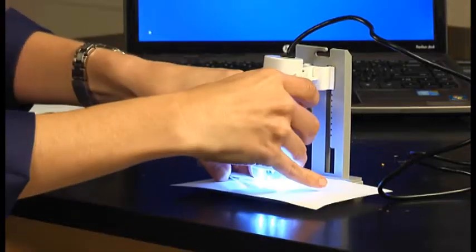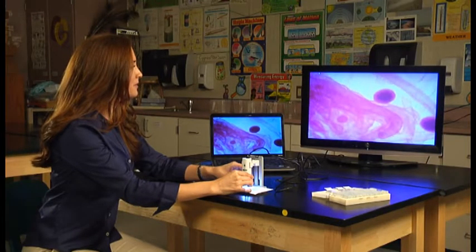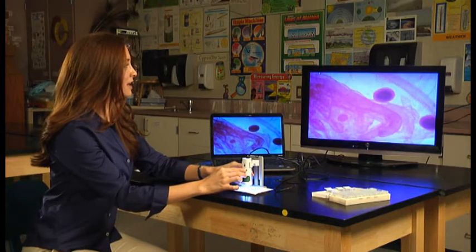Now let's take a look at Daphnia. To bring the image into focus, just adjust the focus dial at the bottom, and don't forget you can also add light with the light dial.